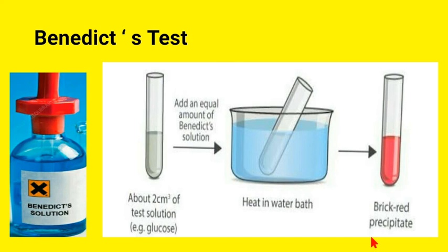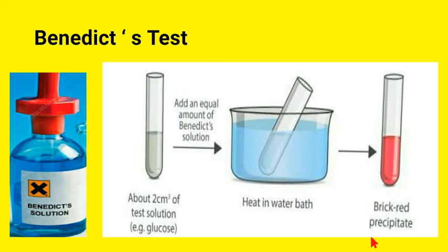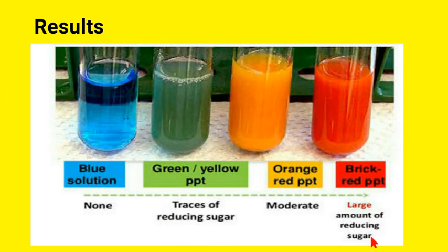And if it shows these colors like green and orange, it shows that less glucose is present.